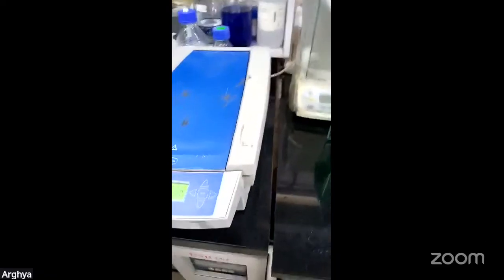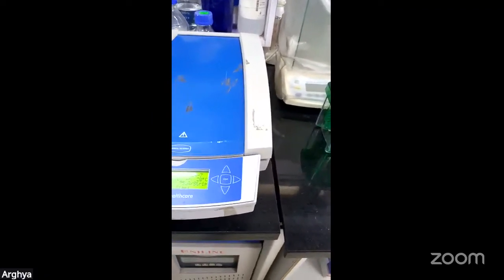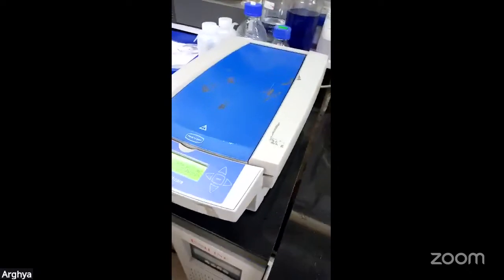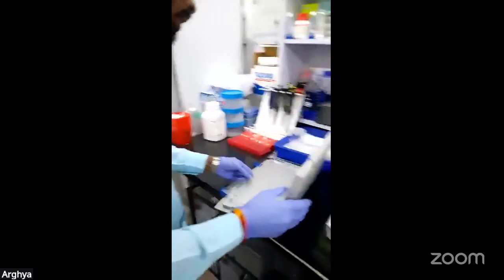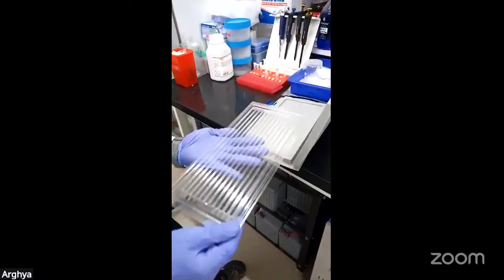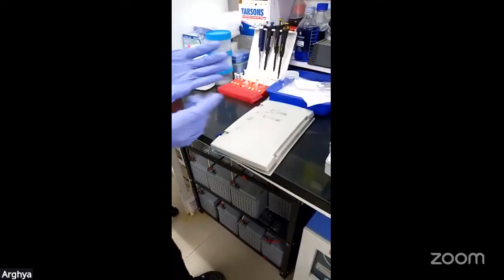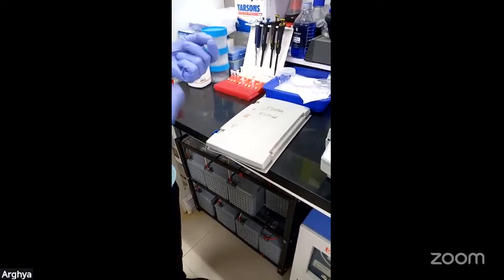So thank you, Prof. What you are seeing is an Ettan IPGphor 3, which, as in the figures I have already shown, is used for the first dimension, the isoelectric focusing. We have our demonstrator Nitin with us. So Nitin, you can start the steps. First, we prepare the protein using a rehydration buffer. We load the protein sample with rehydration buffer in a rehydration tray. This step goes for 10 to 16 hours for complete rehydration and complete uniform protein distribution.